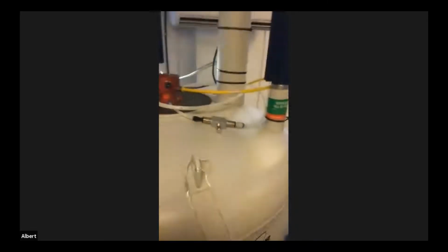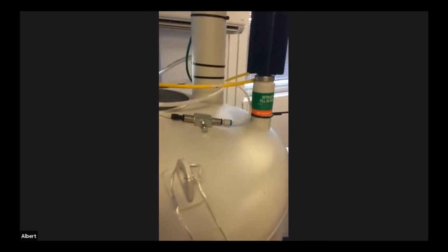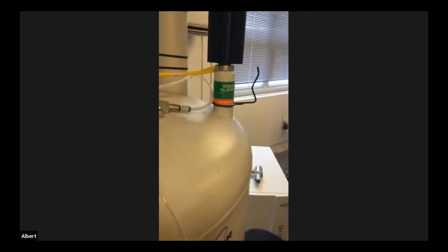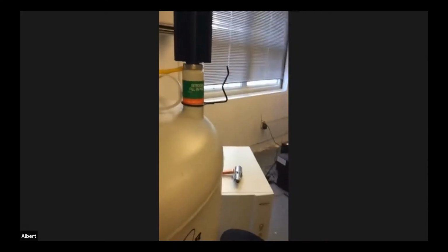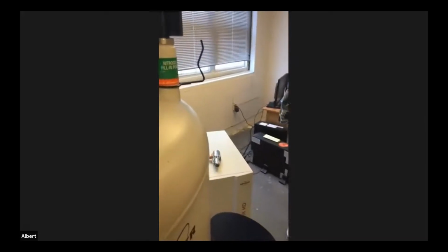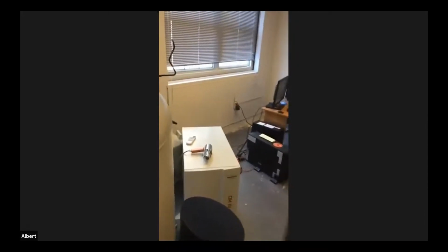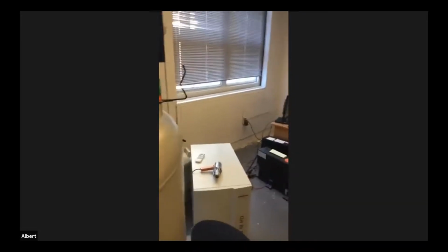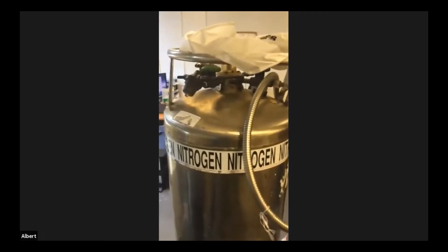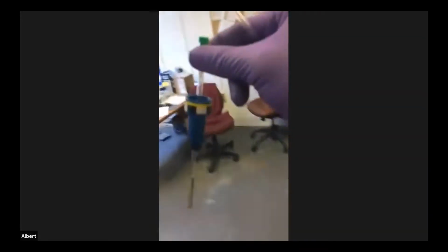And I don't know if y'all can hear that, but you hear that little hissing? That's compressed air. If you don't hear that, do not put a sample in. It's going to drop straight to the bottom. It's probably going to break. Probably going to have to call the company. They start charging you from the time they get in the car to drive to the airport. So a normal repair like that will probably cost us about 50 grand. So if you don't hear the air, don't put a sample in. All right. So I'm going to take this over to here.